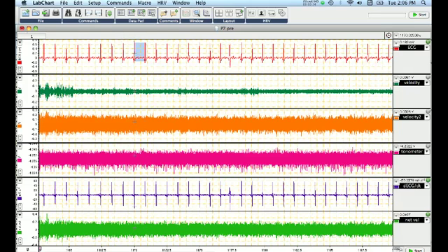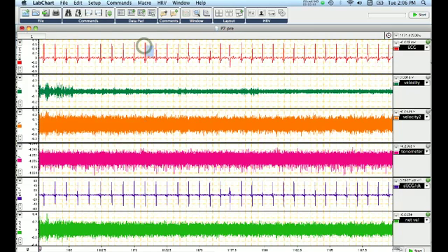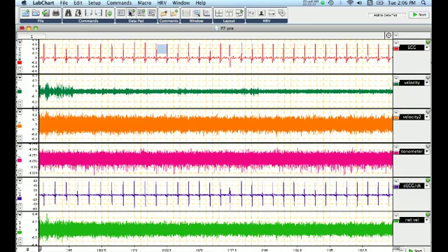Determine how long it takes between QRS complexes, so your R to R interval from R wave to R wave. And then you want to move along and get the next one, and then follow this by the following one, and all the while dumping this information into Datapad.